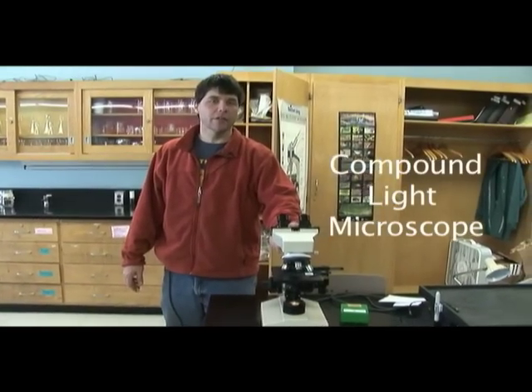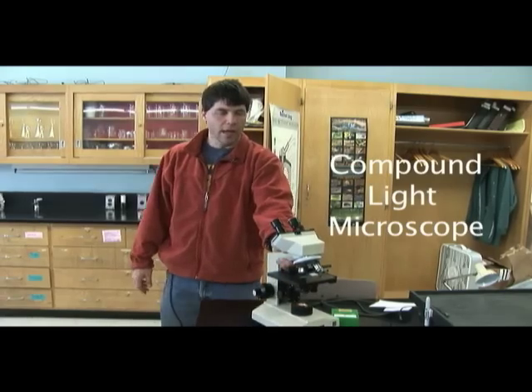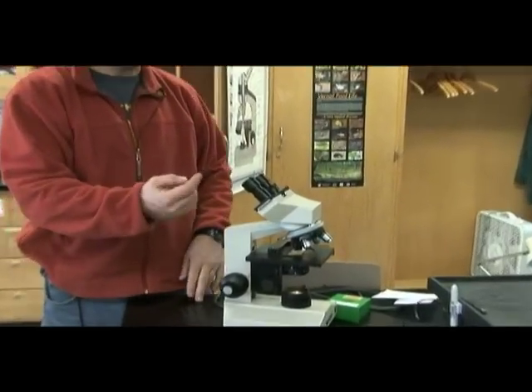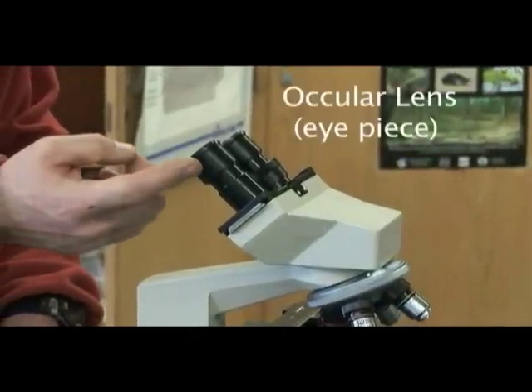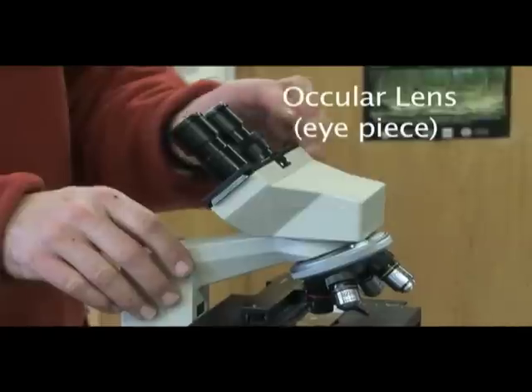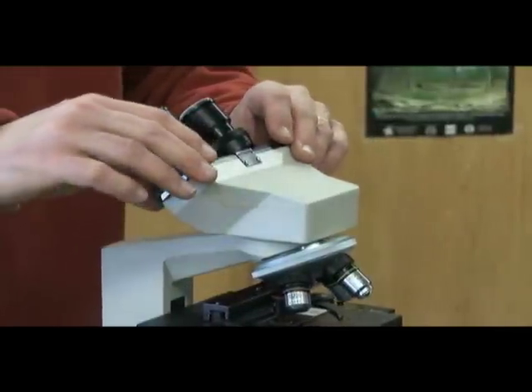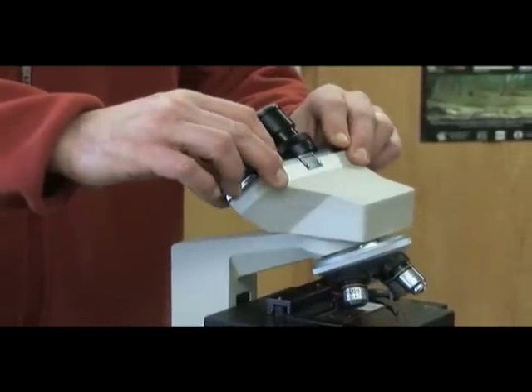I'd like to talk to you today about use of the compound light microscope, the binocular scope that we are using in lab this year. And I'd like to introduce you first to the various parts of the scope. We could start here at the top. The part closest to your eye is called the ocular lens or eyepiece. Either is okay to use. Here we have an adjustment for those ocular lenses.